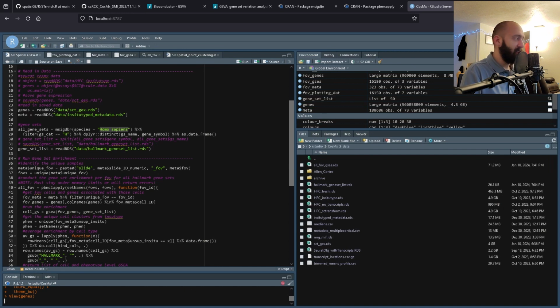Might be easier if I just restart it. But then I will lose everything.